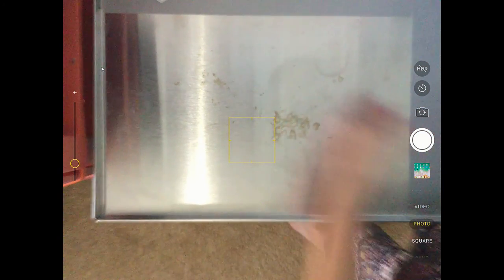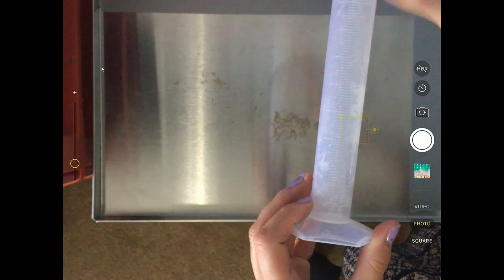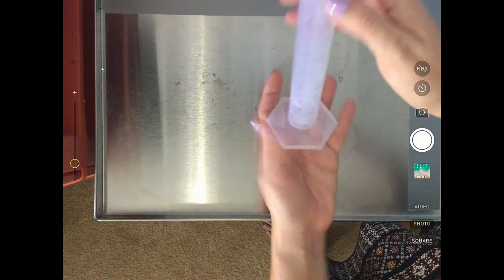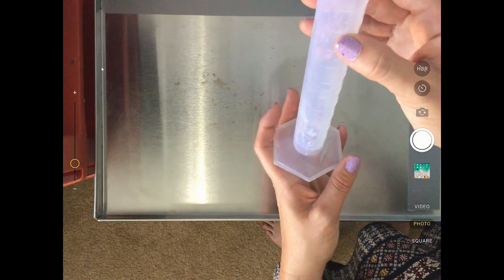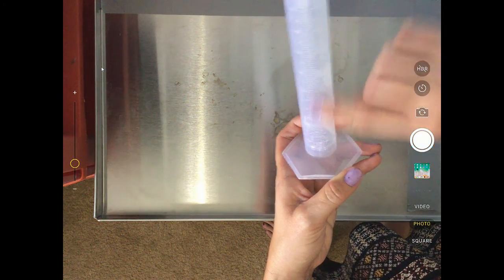Another common confusion point that I see with kids is confusing a graduated cylinder with a beaker. These are also two totally separate tools. A graduated cylinder is in the shape of a cylinder. It's called graduated because all along the side, you've got these little measurement marks. That is what makes it graduated. The volume, the amount of empty space inside this three-dimensional figure, is broken up or graduated into individual milliliters, and those milliliters are recorded along the side in little hash marks.